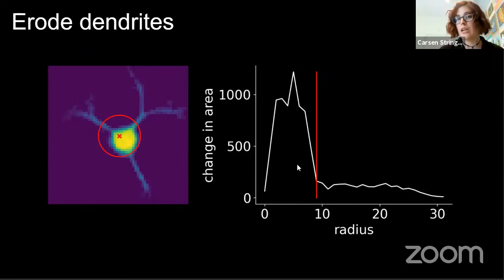In calcium imaging, generally the cells don't have high baseline fluorescence, so having a functional segmenter is really important. You really want to find correlated things because you don't see them unless they're firing. But for some indicators, like a voltage indicator where the baseline is relatively high, you might just want to do an anatomical segmentation. Something like Cellpose might be good, or people have also been developing other types of techniques like that.